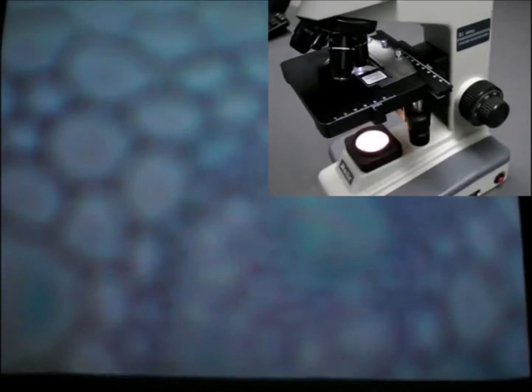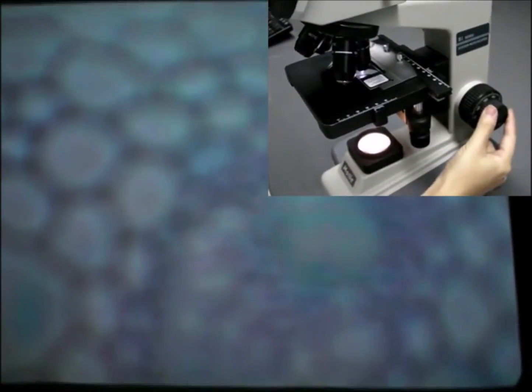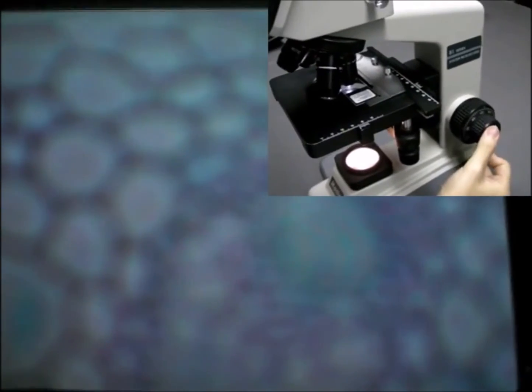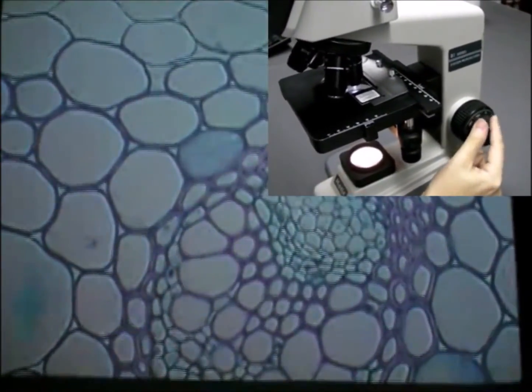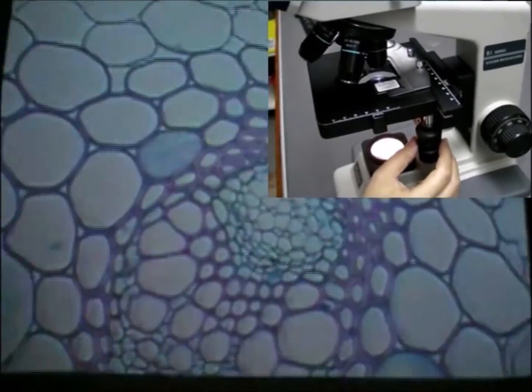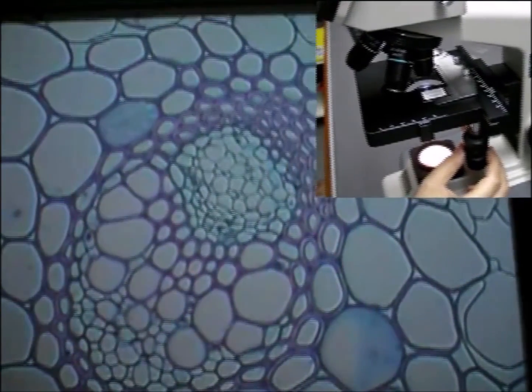Bring the cell to the center of the field of view. Change to the objective lens of the next higher magnification, for example 40 times. The image will be blurred again. Refocus the image by using the fine focusing knob. Bring the cell to the center of the field of view.